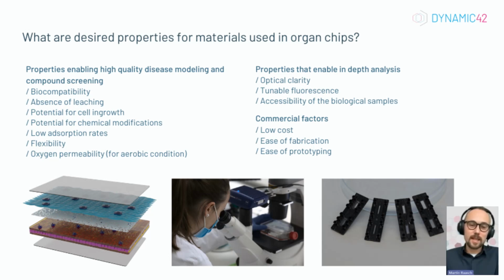Also tunable fluorescence of the material and accessibility of the biological sample. Can you recover your tissue from the device afterwards as a whole or as single cells? Or does an attempt to recover the tissue result in destroying your model?